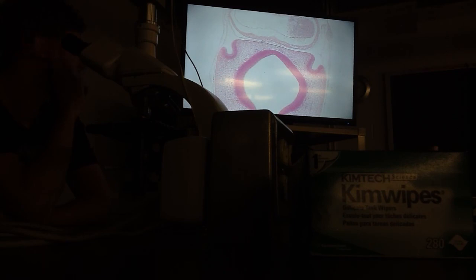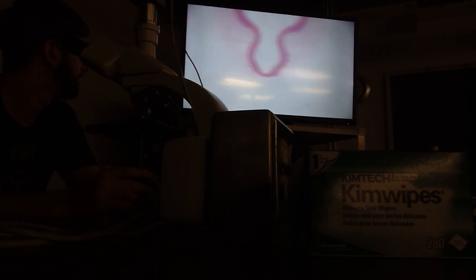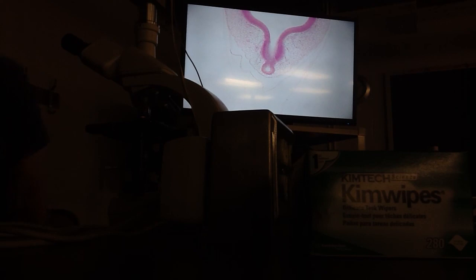Okay? Oh, look at that. Isn't that beautiful? It is beautiful. Okay, so I'm a developmental biologist. I see beauty in different ways. Here is a nose, a developing nose. It's beautiful. Okay? And look at that beautiful development. Oh, look at that! Yes, photograph it. Put that one on the exam, sir. That's a great pattern. Okay?